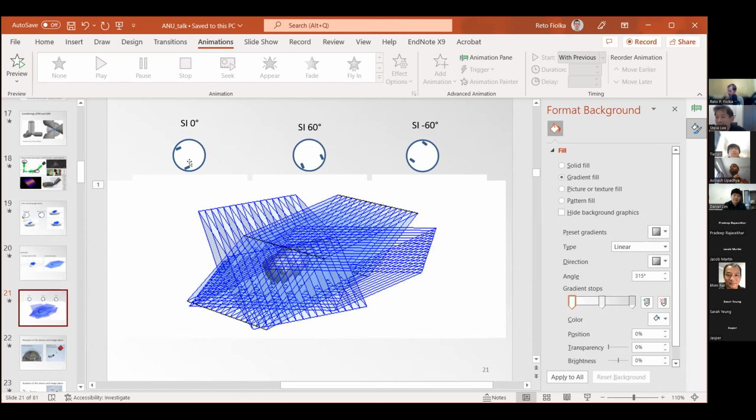It would have competition. You can have a Pockels cell, which is of course super fast. But I don't think you can have a large Pockels cell, or there are not many good ones. So you could rotate polarization on an entire image, which I think is harder to do with a Pockels cell. Yeah. Okay. Cool.